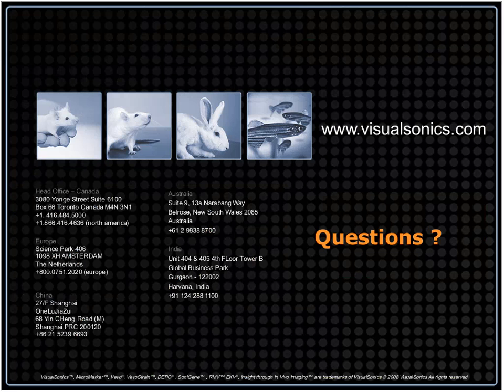All right. Thank you very much, Drew. That was a very interesting range of models and approaches that we can use with the high-frequency ultrasound system and photoacoustics. We're taking a few questions. I have categorized questions that walk along the same line of thinking. Most of the data were in mice, but there were some data on rats. Could you comment on how deep this imaging can accurately portray the brain? Does it have to be with an open skull, or can we have the skull and skin intact? And is it possible to investigate transient ischemia models like MCA occlusion using intraluminal suture? Any comments on that, Drew?